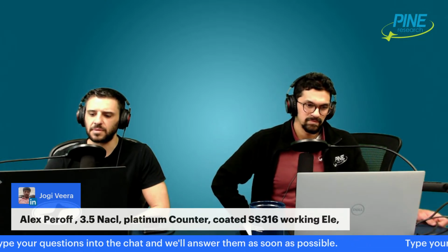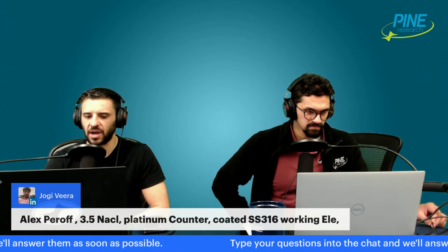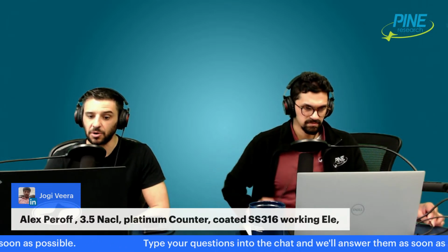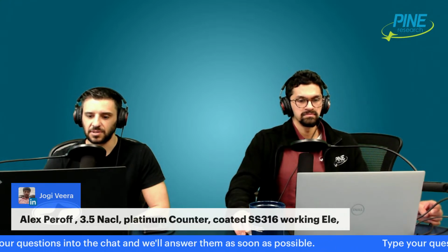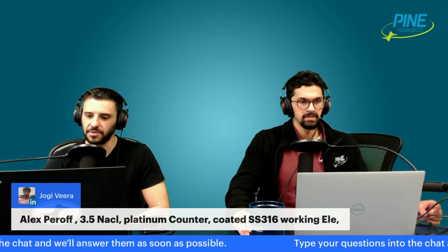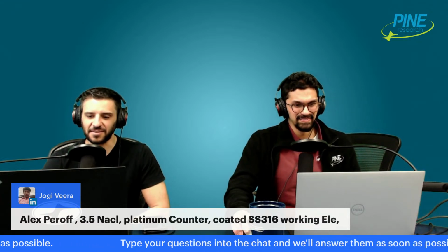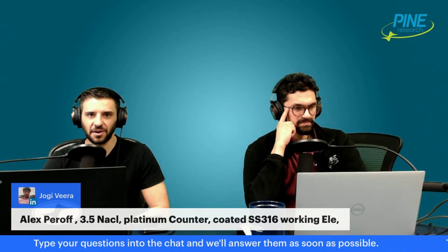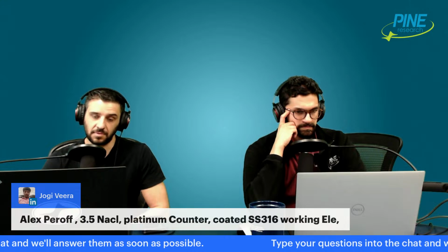Also, the system, it appears he's saying 3.5% brine with platinum counter and a coated 316 stainless steel working electrode. Okay. So the other thing is that you're probably not going to get a lot of corrosion. Stainless steel does not corrode much at all. It's stainless.